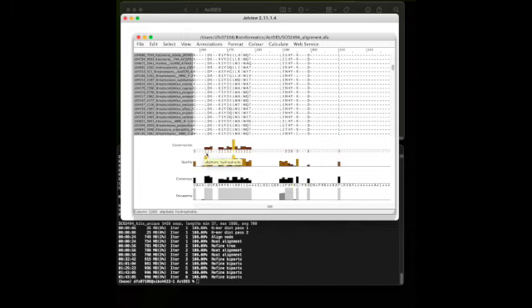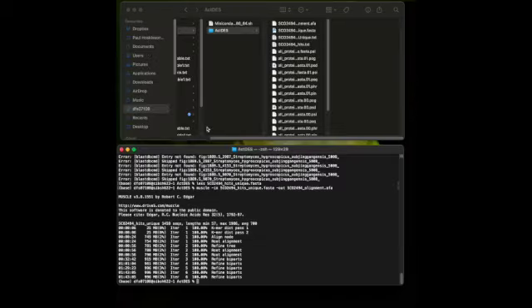So once you've done that, we'll assume that this alignment is fine just to progress to the next stage. But this often requires you to go back and iteratively reprocess and realign sequences once you've edited the sequences out, such as those short ones that we talked about earlier. So we'll assume that that alignment is fine, and we'll move on to the next part of the ActDES database. So we run a small program that is called gblocks.